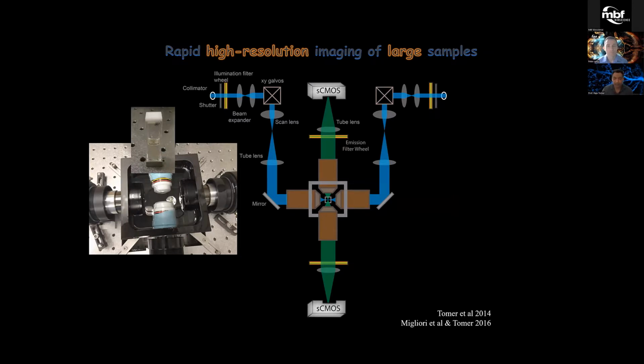So light sheet microscopy, just very briefly, uses a thin sheet of light. My mouse is visible, right, Peter? Yes. So the basic idea is that we create a thin sheet of light which illuminates the sample or the plane that we are trying to image, and then it's only that plane that emits signal, which is collected by a standard wide field detection arm, right?